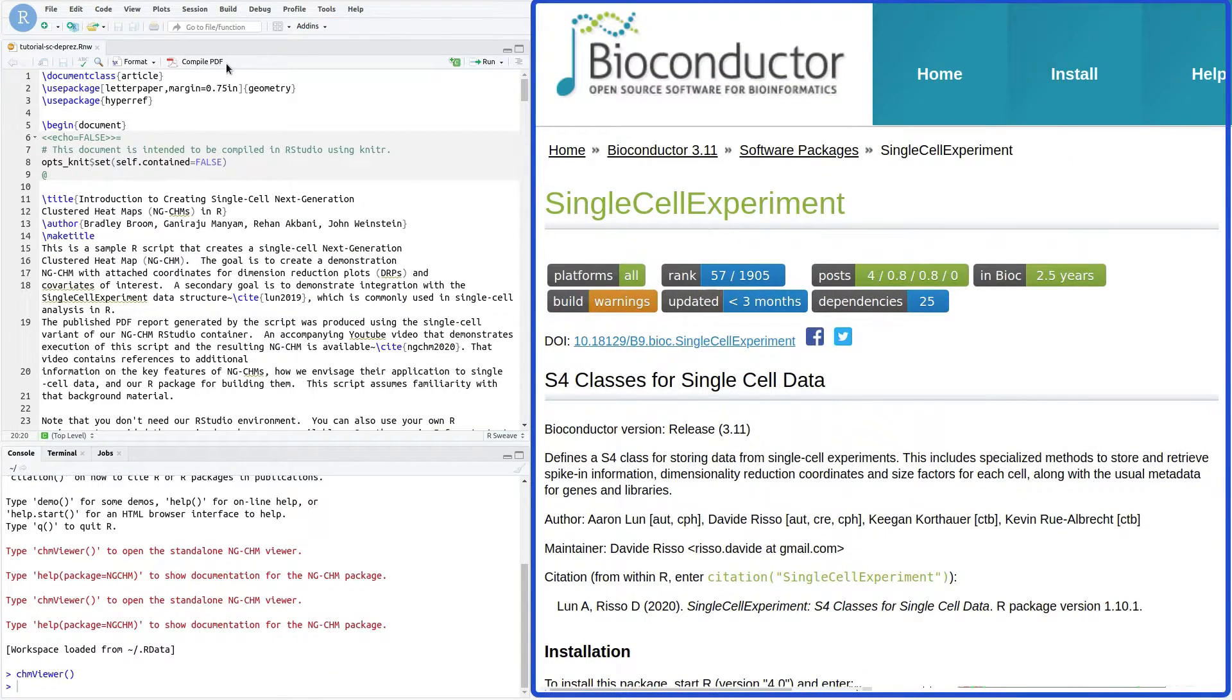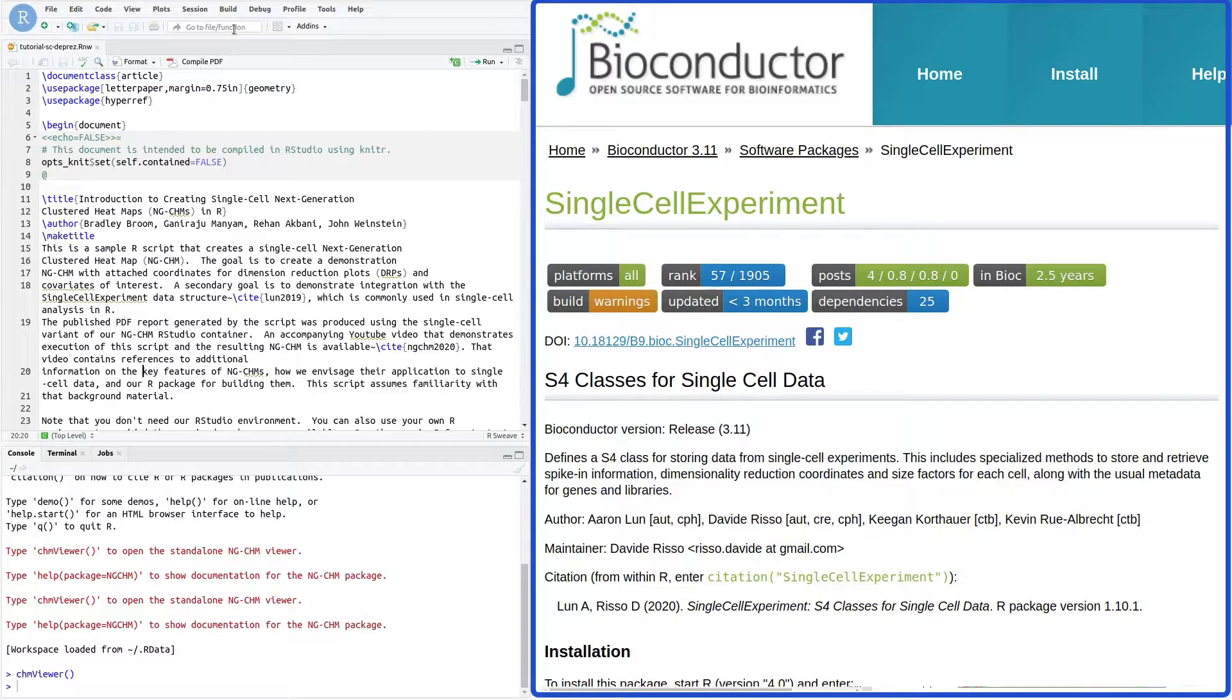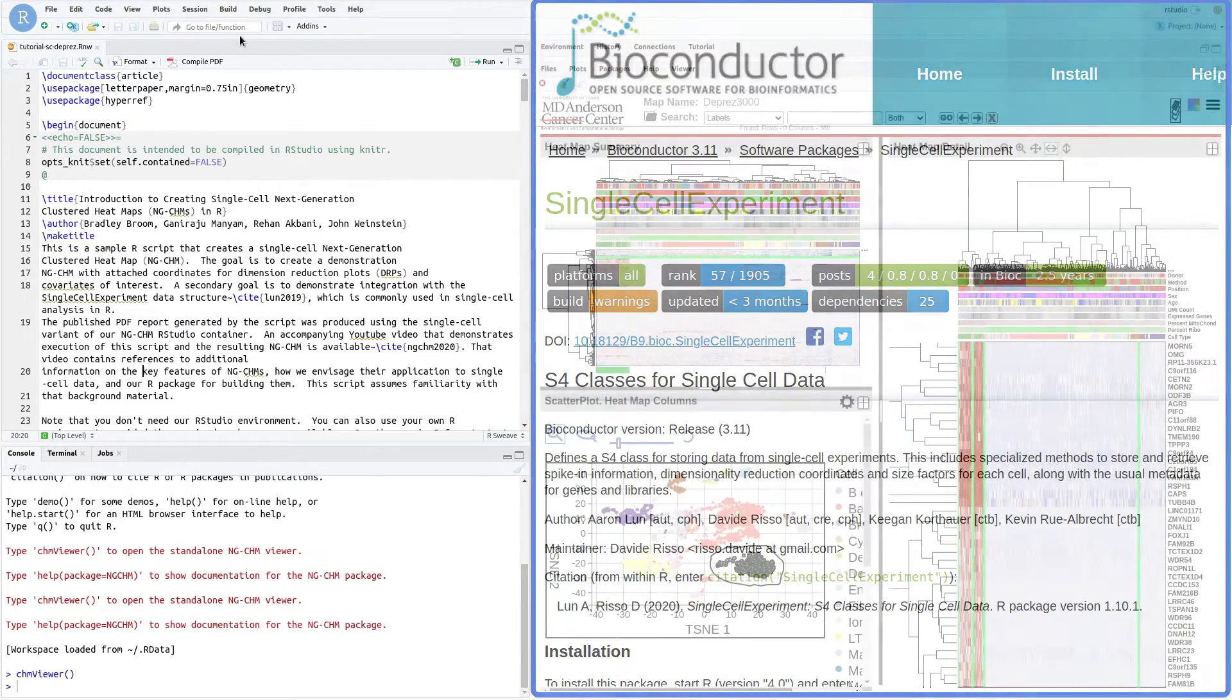For this video, we will also use the single-cell experiment data structure that is widely used in the analysis of single-cell data in R. Note that you can also create single-cell NGCHMs using other data structures if you wish.